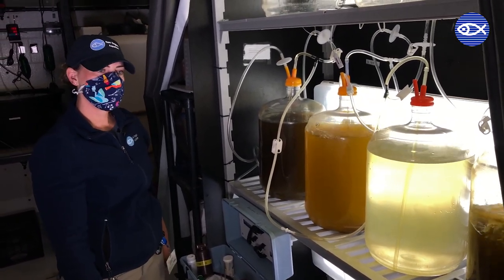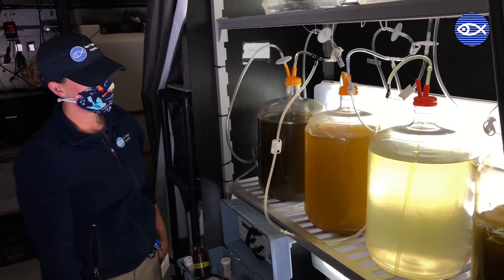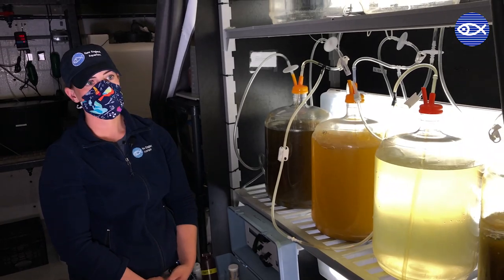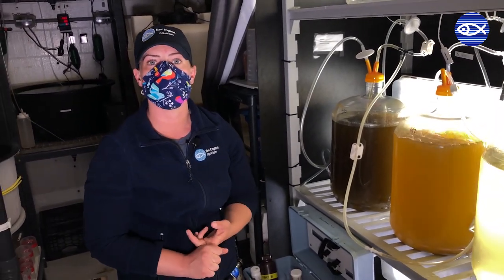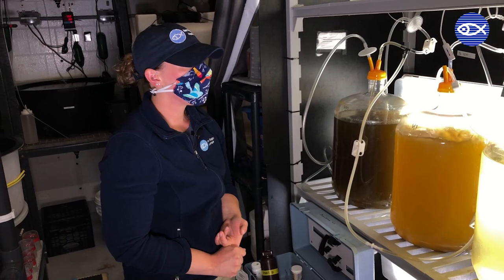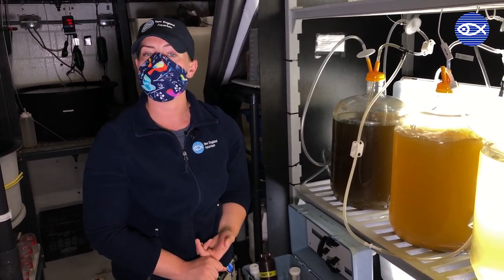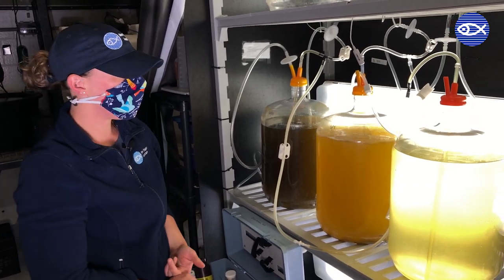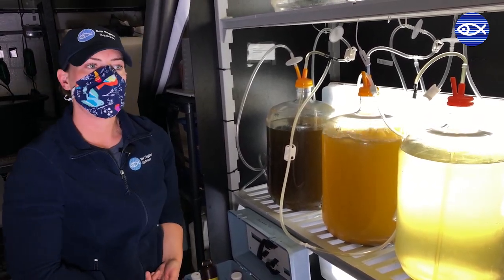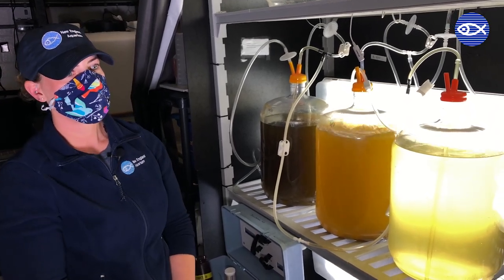While we're waiting for the algae to fill into our new bottle, can you explain why it's important to grow algae here at the aquarium? Sure. Number one, we can control the nutrients we're putting into it. We can control the quality and make sure it's as healthy as possible for our animals. It's also a cost saver versus purchasing it from a vendor — growing it in-house is much less pricey. I always think this room looks like a mad science experiment, and I love seeing all the different colors of algae growing, knowing it's going to become high quality food for our animals here at the aquarium.